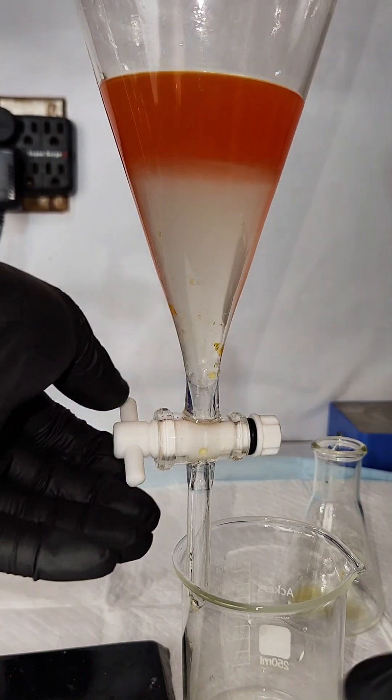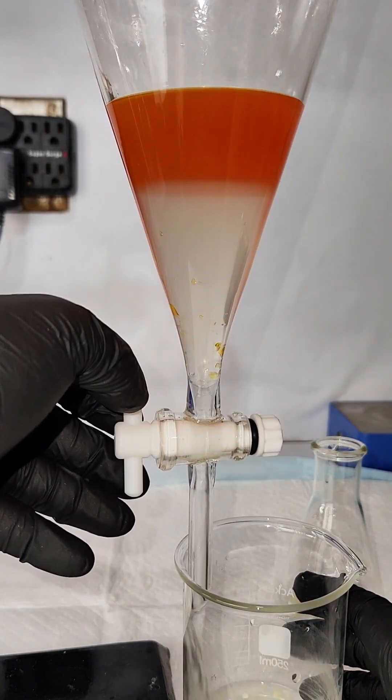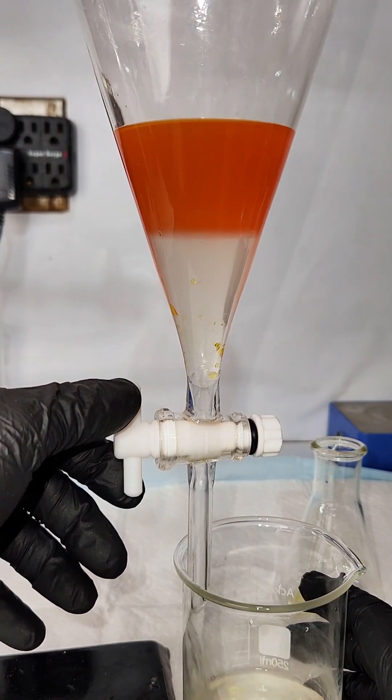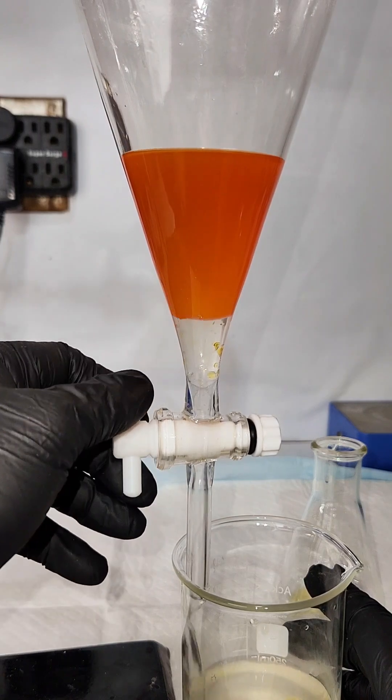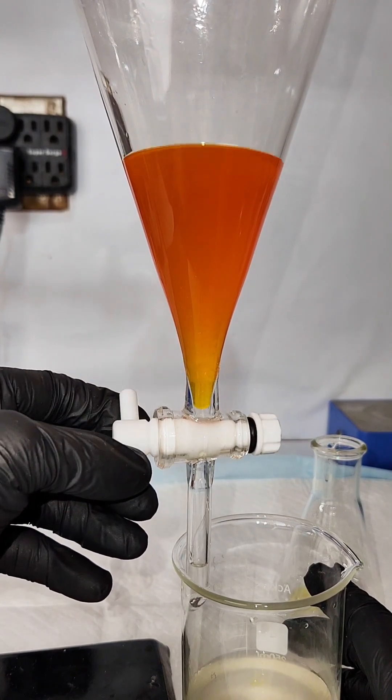When I'm done shaking my separatory funnel, I drain off my lower aqueous layer which does look like it picked up some kind of contamination. I then drain off my upper layer containing my benzene into a small Erlenmeyer flask.